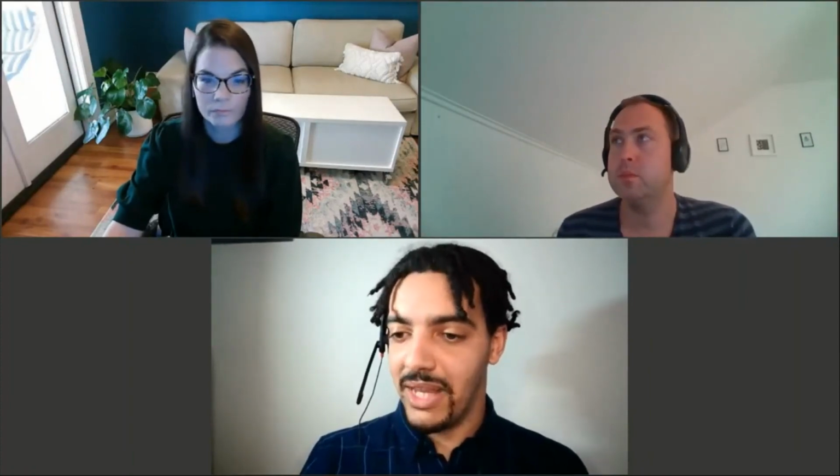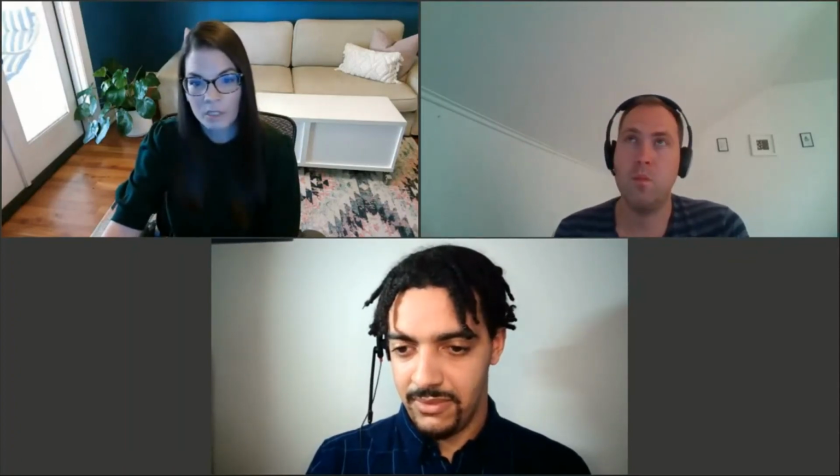Great, thanks a lot. Our next question goes to Marianne. Are Kaiser systems compatible with GAMP5 integrated automation requirements? Yeah, our runtime platform is developed according to GAMP. Runtime itself is meant to continuously collect and distribute data. It's not meant for long-term data storage. So it does not meet all requirements for 21 CFR Part 11 compliance in GMP. But we work with standard platforms that are used for handling spectroscopic data in a GMP environment. So it's compatible with all the standard platforms being used in industry now.